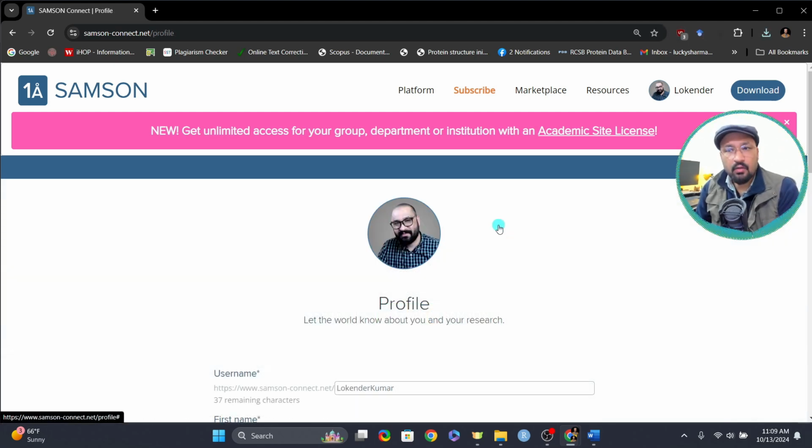All right, now let's go to SAMSON and understand various tools that are available and how you can use SAMSON from scratch. And then I'll be doing a few things, not all of them, because this video is going to be very, very long. I want you to download this and also follow along with me, because that is the best way to learn things. Initially you are going to have some issues with the mouse button and all. I'll help you out with that one. So let's start the tutorial and let's see what SAMSON provides you.